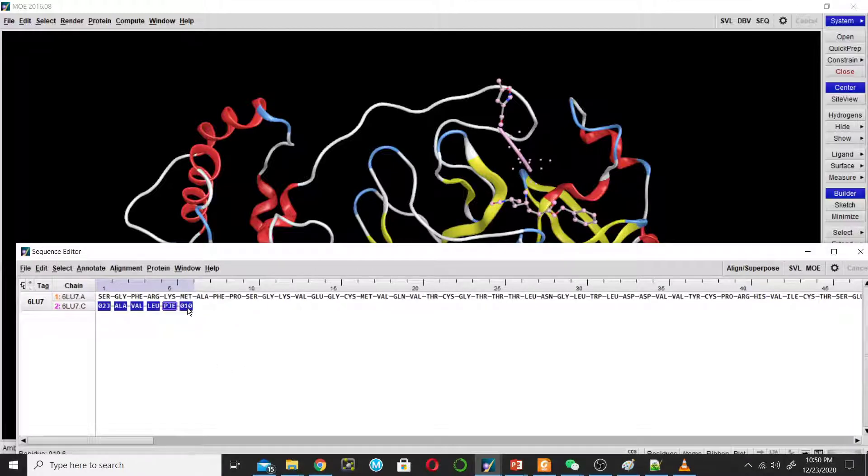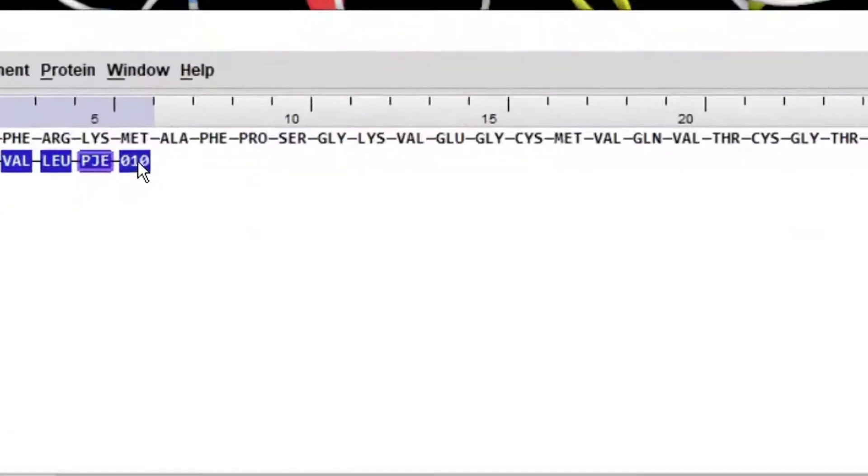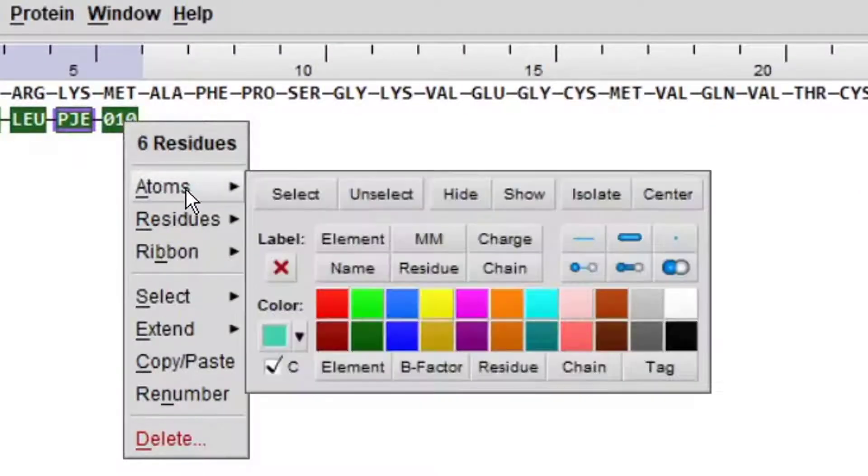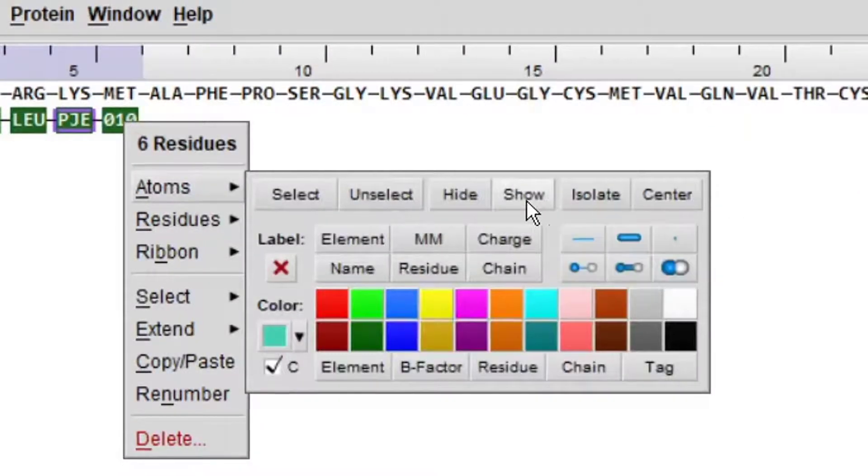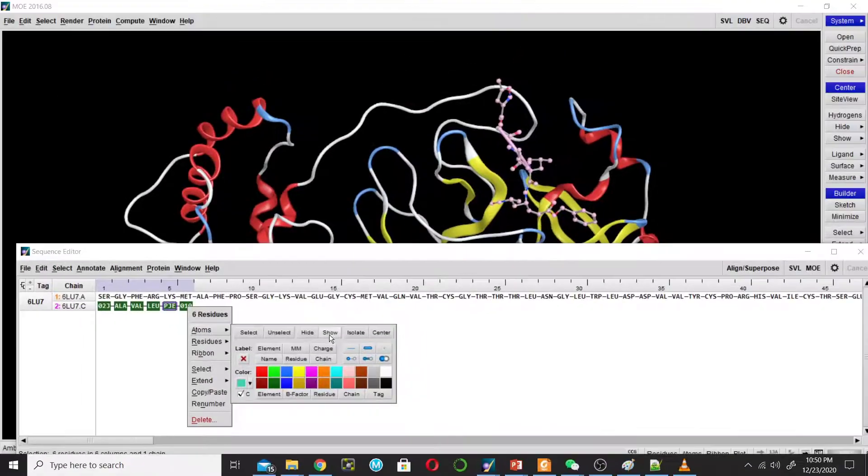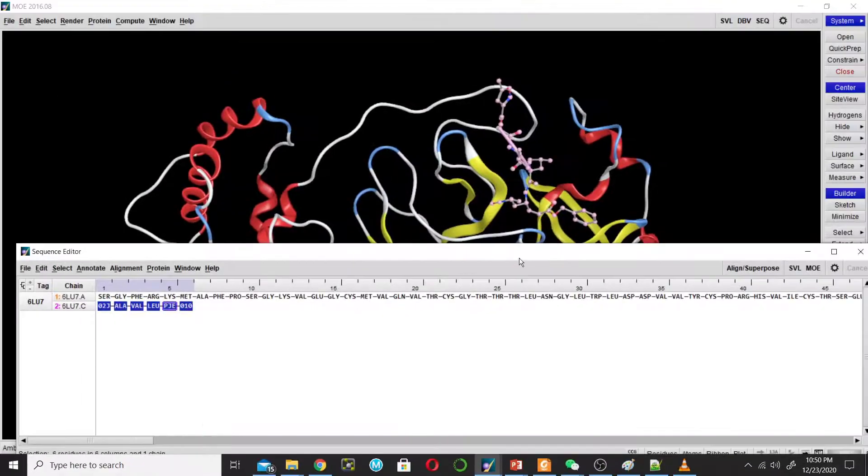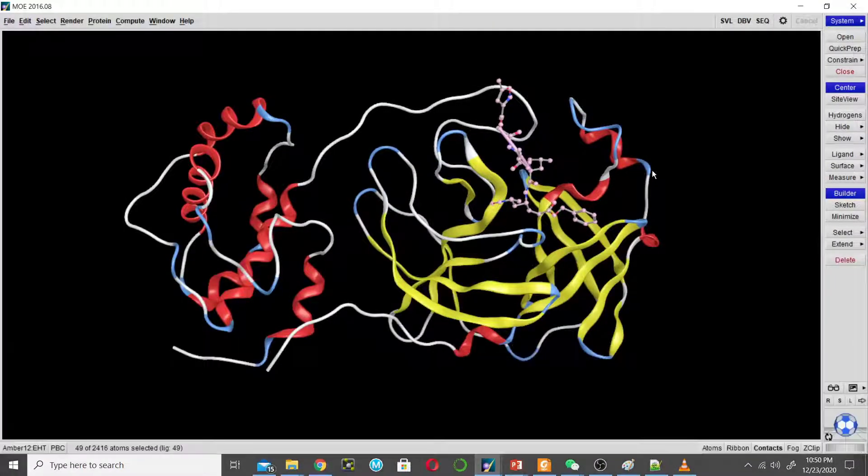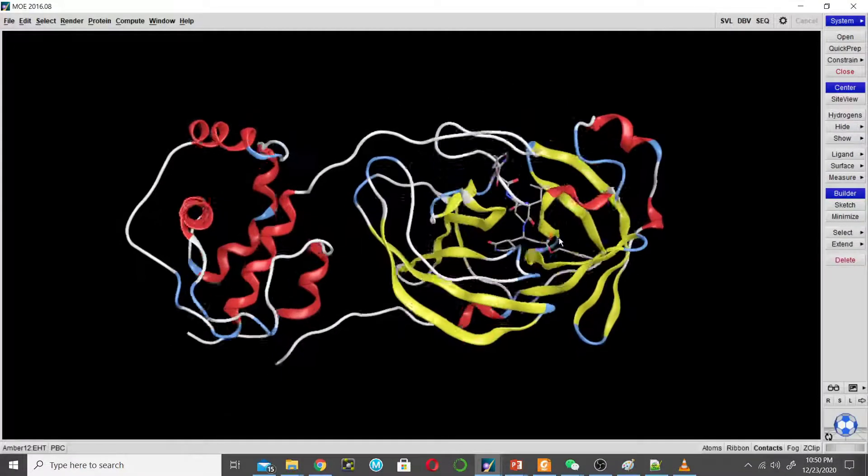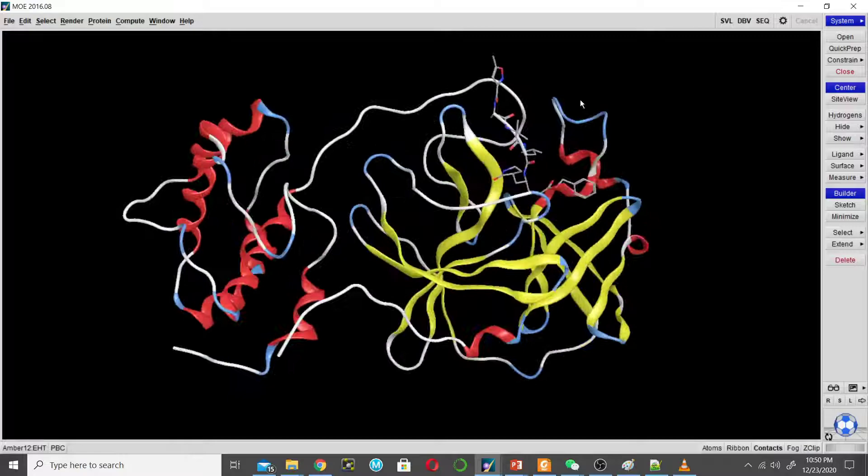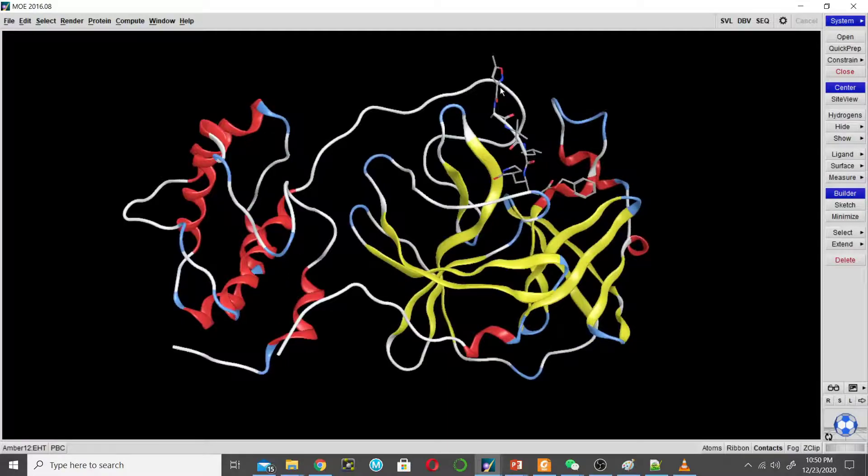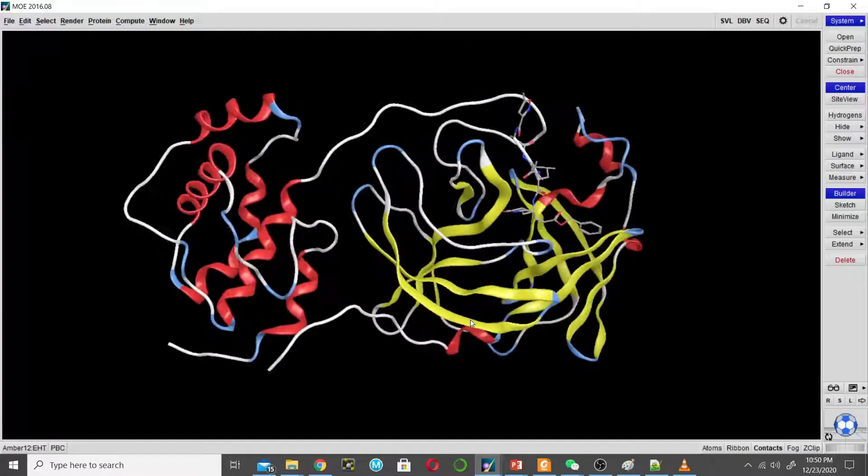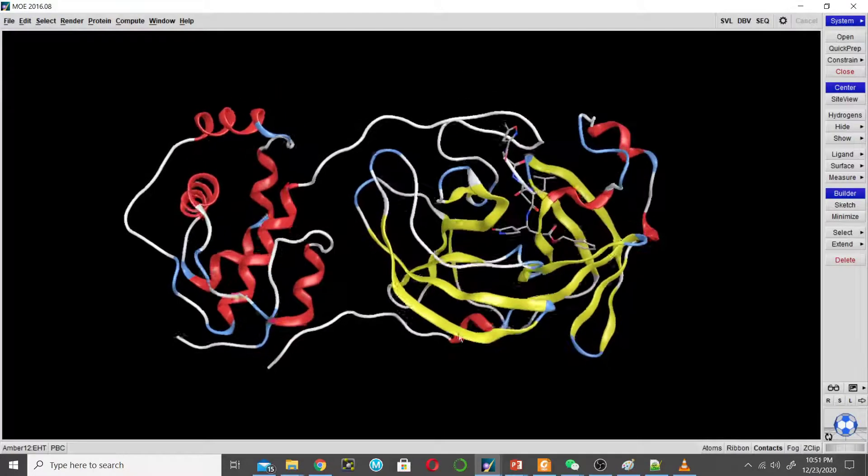Then go to atom and then show. So this is the ligand. It's a peptide-like inhibitor of this enzyme. This structure contains protein sequence and it also contains peptide-like inhibitor.